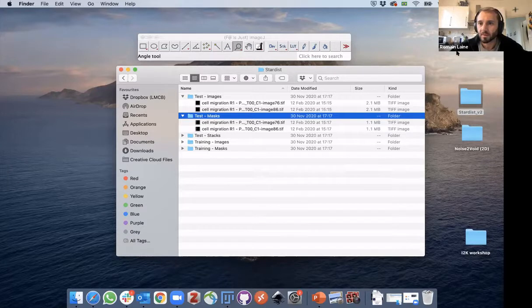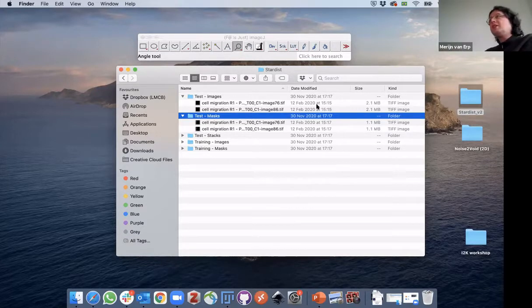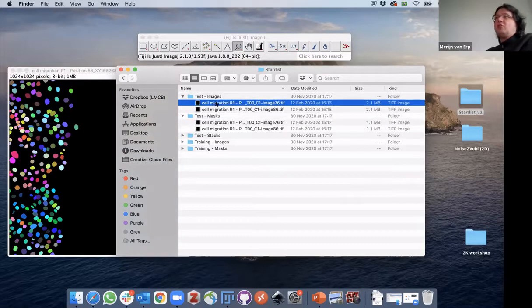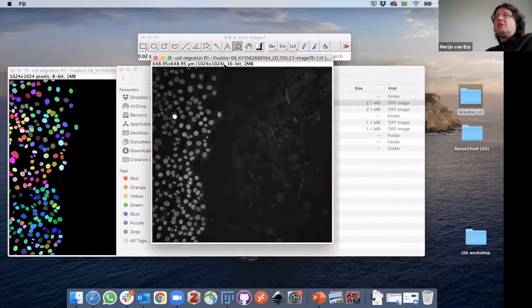You explained the difference between the pixel type classification and the object classification. I'm familiar with the pixel kind one. In here, you have an annotation or a ground truth in which each object kind of gets its own class.